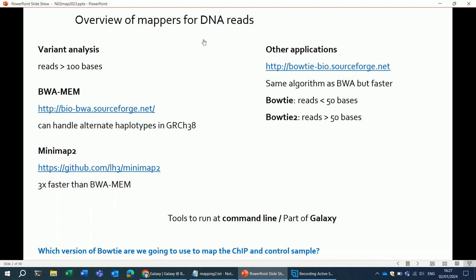Because these algorithms need to map the reads to this huge genome sequence, they will handle the genome sequence differently than BLAST handles the database of sequences that it aligns to. So these mappers make the genome more compact, so it will fit in the memory of a regular computer.